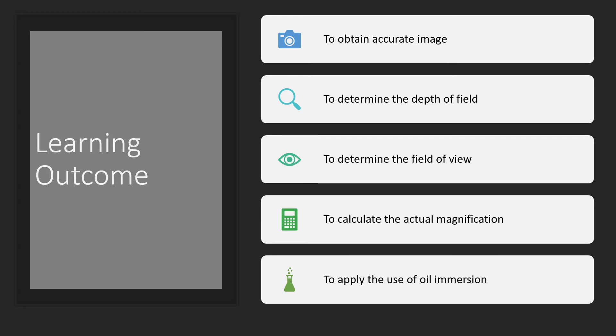We have 5 learning outcomes in this experiment, which are to obtain accurate images, to determine the depth of field, to determine the field of view, to calculate the actual magnification, and to apply the use of oil immersion.